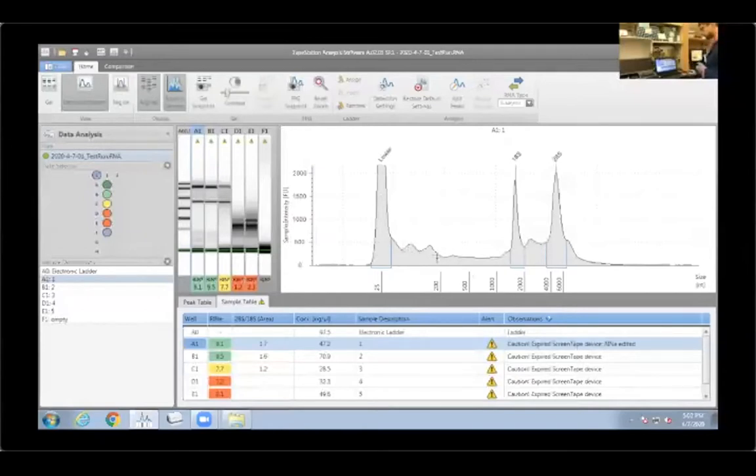And then you see some noise in this region. And so basically here you have, it might be tRNAs and also the 5S ribosomal RNA. And all the noise, the background that you see here, it's basically messenger RNAs, okay? So you don't see a peak for messenger RNA because the size of messenger RNA is very variable, and the frequency of messenger RNAs is not really high. So we're talking about usually 5% of the total RNA that you have loaded here, okay?